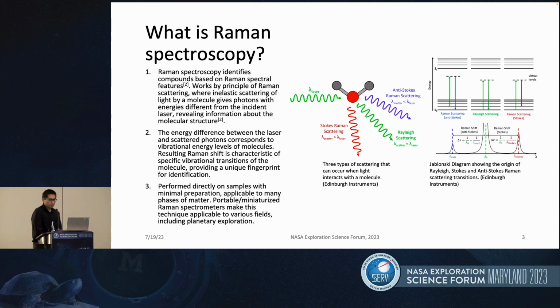By measuring the Raman shifts and their intensities, one can identify compounds present in the sample and their relative abundances as well. Portable Raman spectrometers have expanded the application of this technique to fields as diverse as material sciences, pharmaceuticals, environmental science, as well as geology.